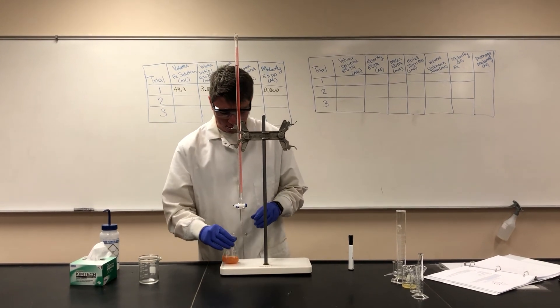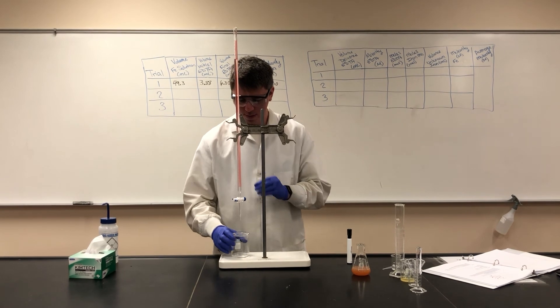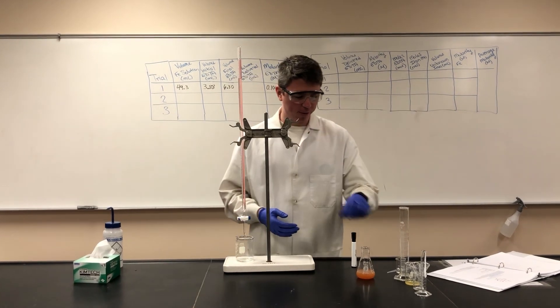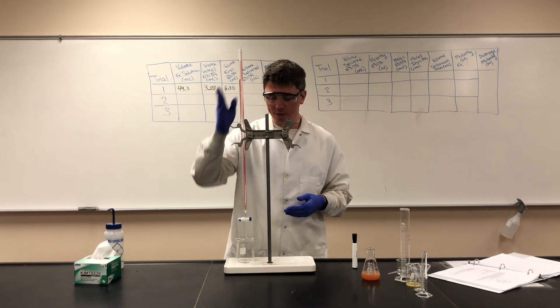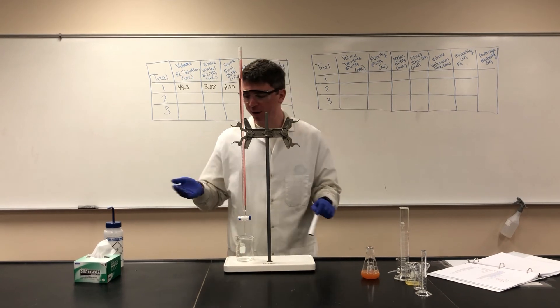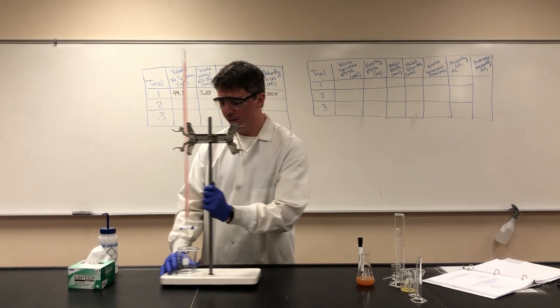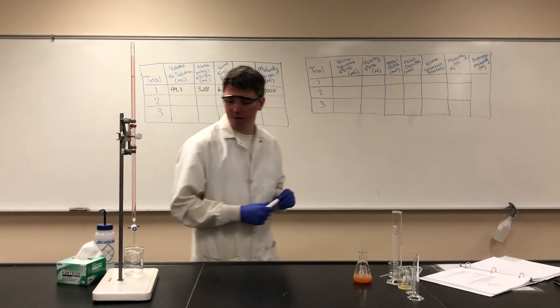At this point, our sample is done. If we were performing multiple trials, we would have another Erlenmeyer flask ready to go, slide it under, record our new starting volume, titrate until we get the orange color, and record our final volume for however many trials we need. Since we're not going to do all three trials in this video, I will go ahead and move on to the calculations for a titration.